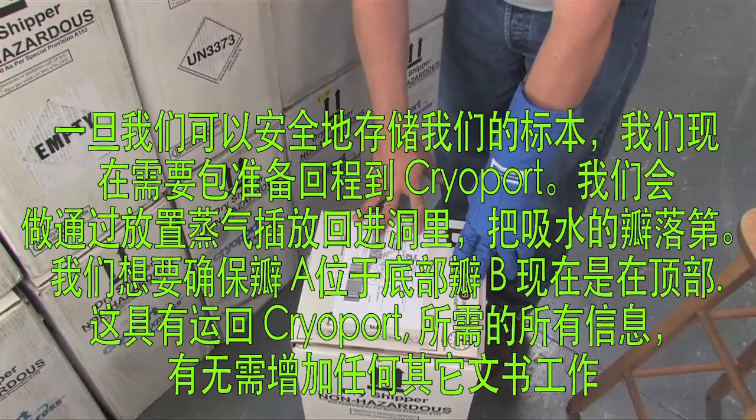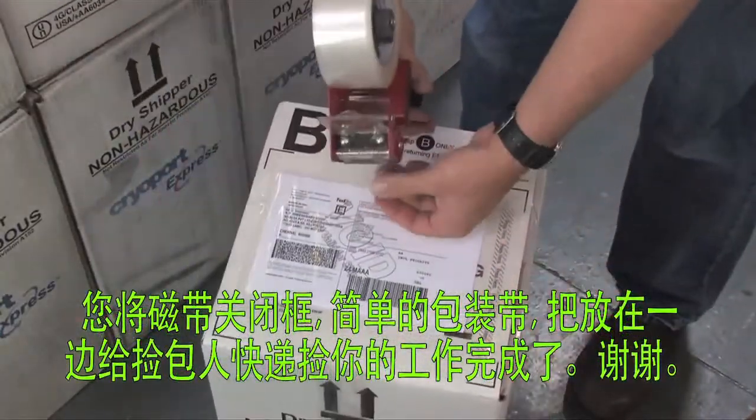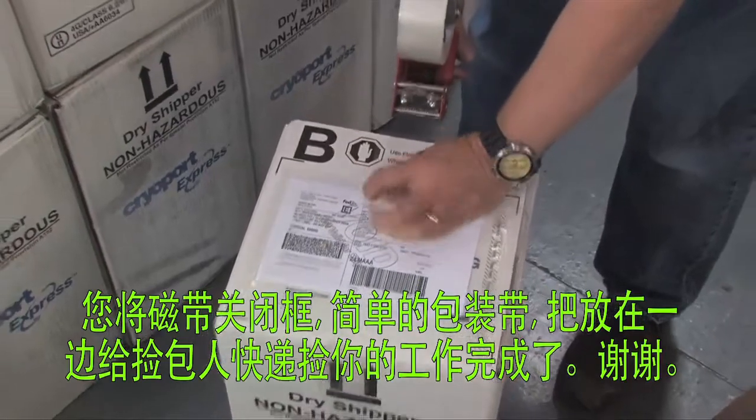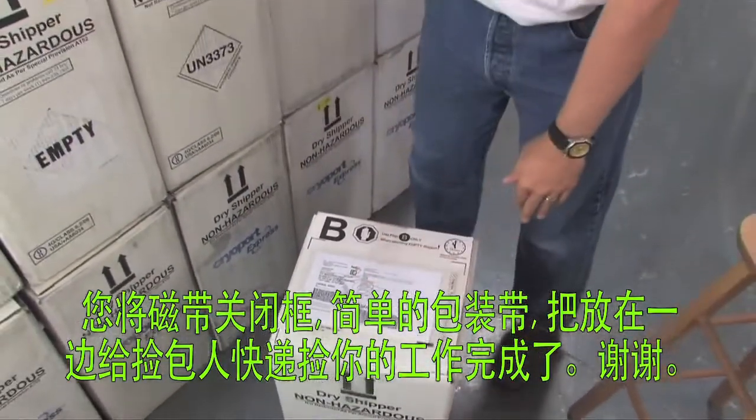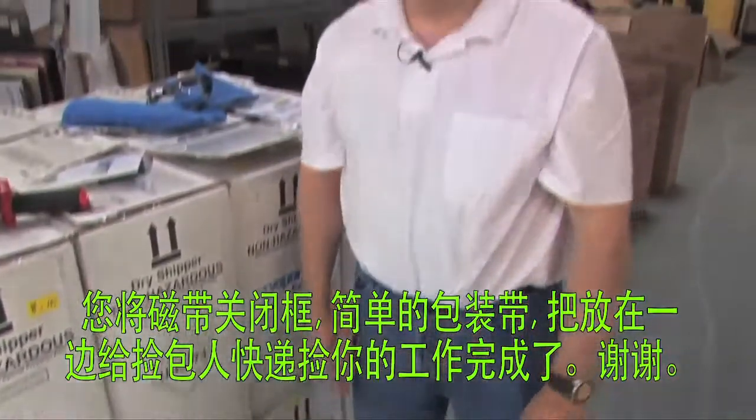There's no additional need for additional paperwork. You'll tape the box closed with simple packaging tape and leave it out for FedEx to pick up, and your job is done.